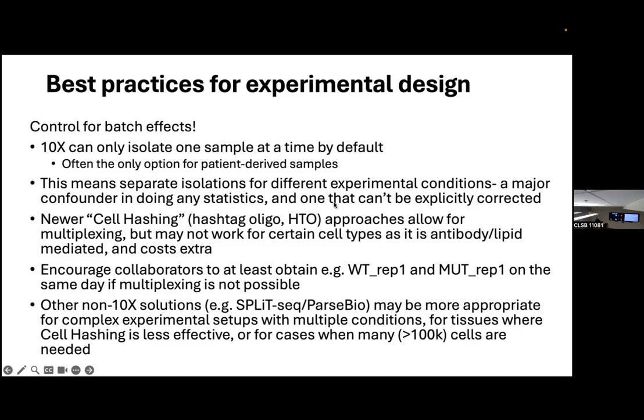And that's often how it's done. So yeah, it is pretty slow. So for those of us working with external collaborators, really try to push people to minimize these batch effects as much as we can.